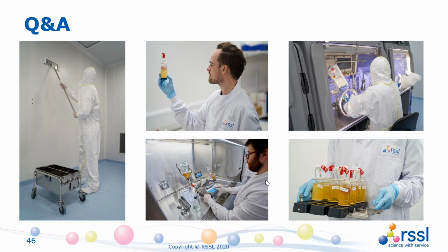Okay. I've got a question from Suresh. When sterility testing is contracted out, do we need to take into consideration environmental isolates from both the manufacturing facility and the contract testing facility for the method suitability validation? That's a very interesting question, and one where there's no exact right or wrong answer. So the inclusion of environmental isolates is fairly standard. There are still some who would say, what's the point? But it is more closer to the norm. So the fact that environmental isolates should be included in the sterility test validation is pretty widely accepted.